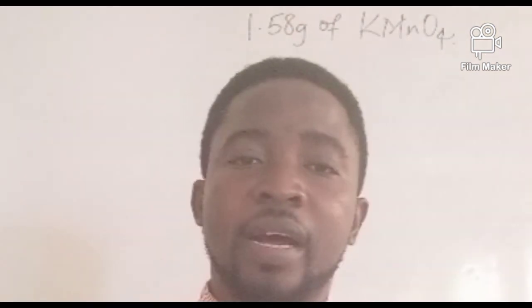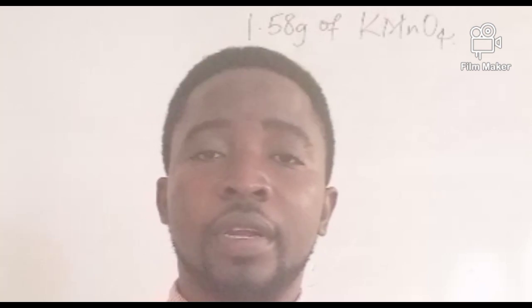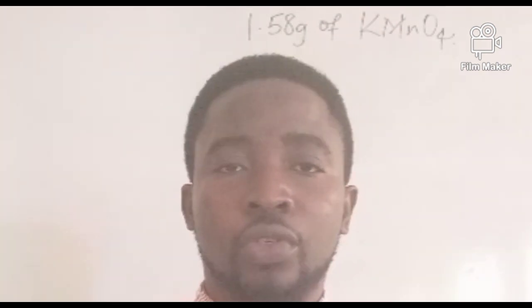In a short while, I'll be taking you through the likely questions to expect in these forthcoming practical chemistry exams. So the titration is going to be a redox titration involving iron 2 sulfate and potassium permanganate. We're going to have analysis of the redox titration involving potassium permanganate solution and iron 2 sulfate.